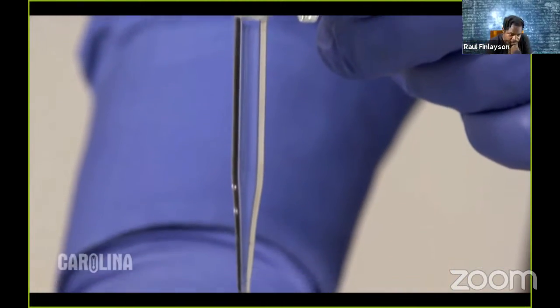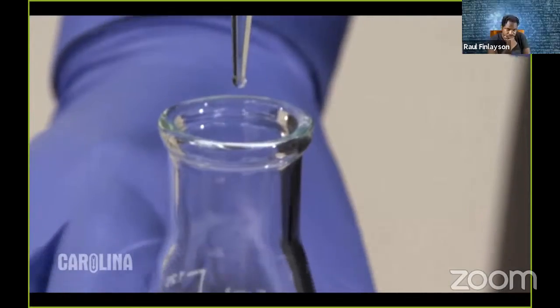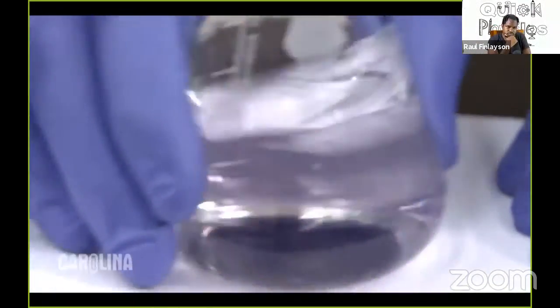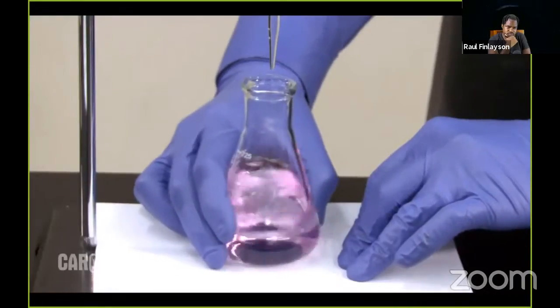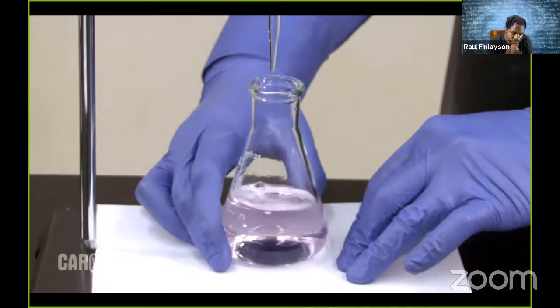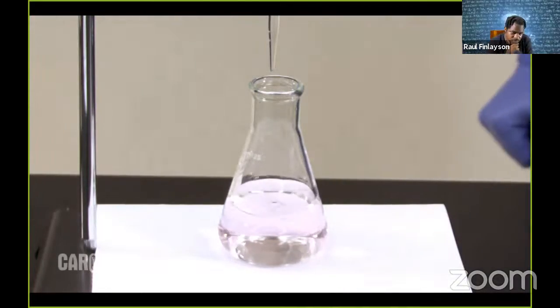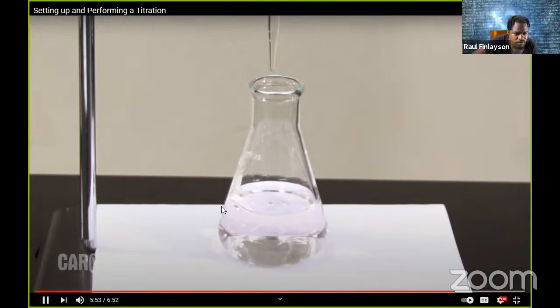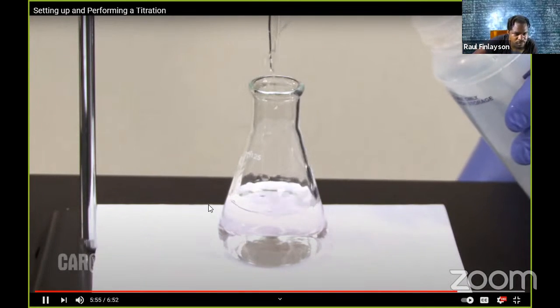Adjust the stopcock to slow the flow of titrant to a dropwise rate. Continue to swirl the flask with one hand and keep the other hand ready to close the stopcock. When you notice the indicator taking longer to fade, close the stopcock. Rinse the tip of the burette with deionized water and swirl the flask. Record the final volume on the burette.